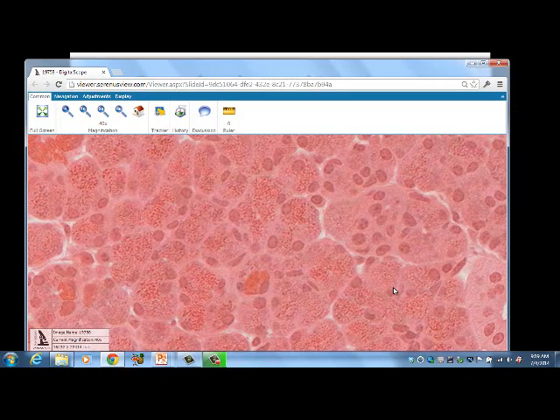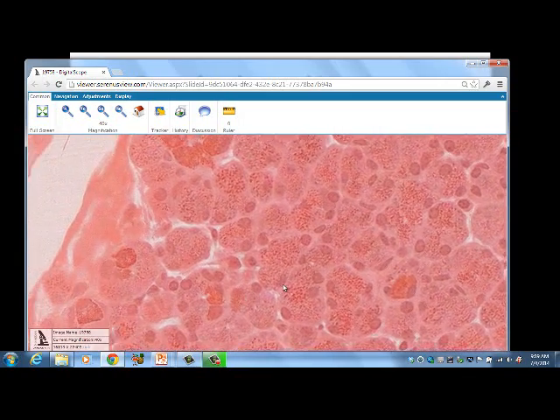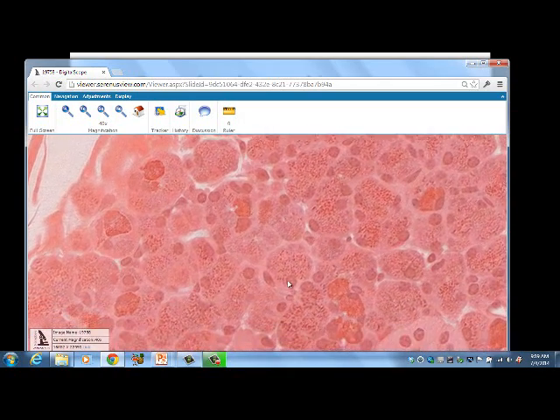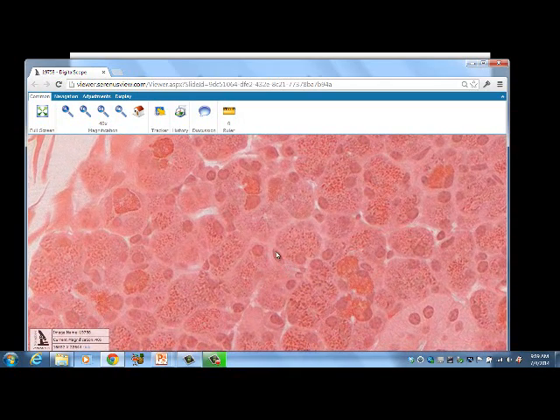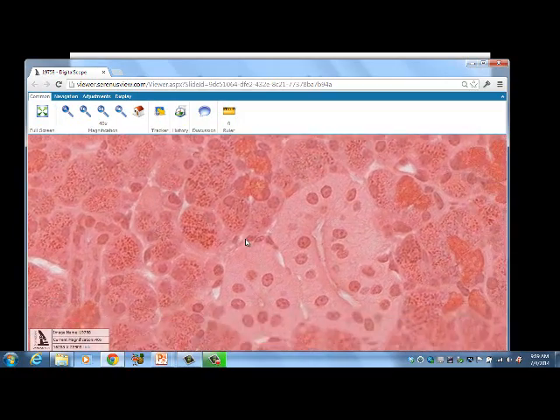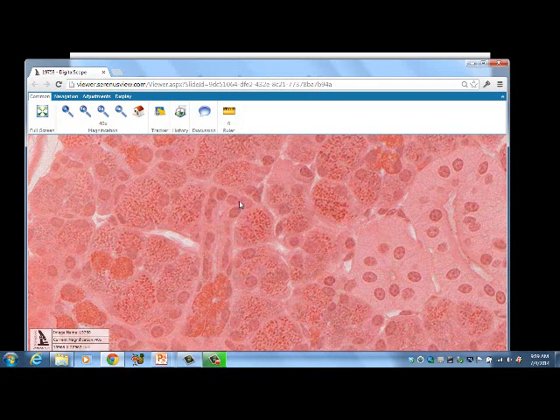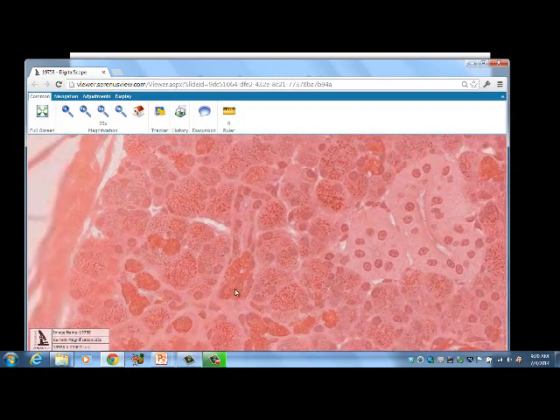Remember, myoepithelium squeezes the secretions out of the acini. This would be like a fibroblast right in the loose connective tissue. This would be more like the myoepithelial cell nucleus that we would see. Here are striated ducts, and this is an intercalated duct that's cut longitudinally, coming out of the acini. This is a mucous type, serous type coming out through there.